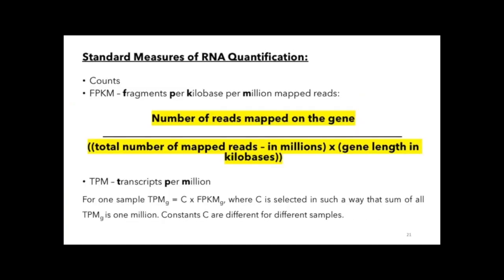Okay, so to understand what this number is, I hope you found it. So you remember what that number looks like. But let's take a look at what it means. We have a number of ways to quantify the number of reads that were aligned to that segment. And here we're looking at the FPKM value. FPKM and TPM are two methods of normalizing those values against the raw counts. That is also one of the options that was available in the settings that we had.